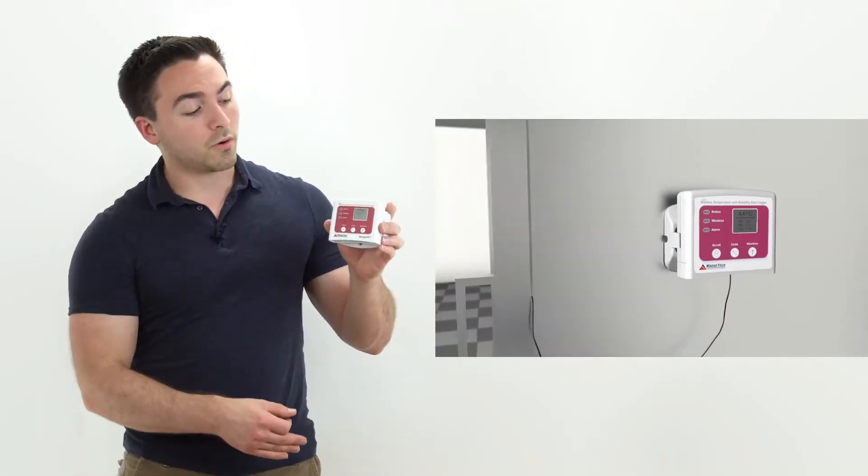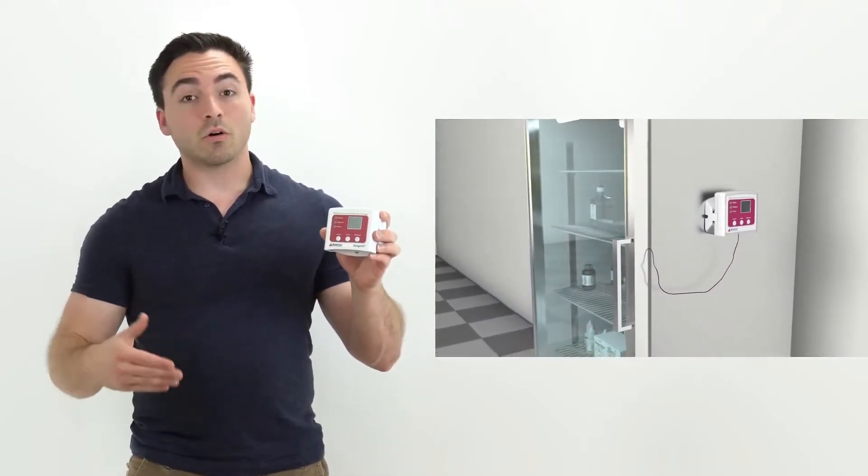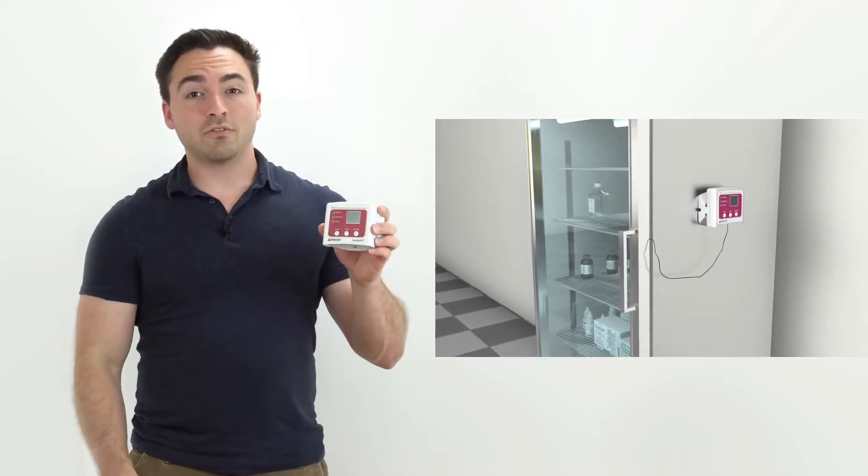The device is also equipped with a user programmable alarm which can alert you via text, email or audible alarm in the event of an out-of-range reading.